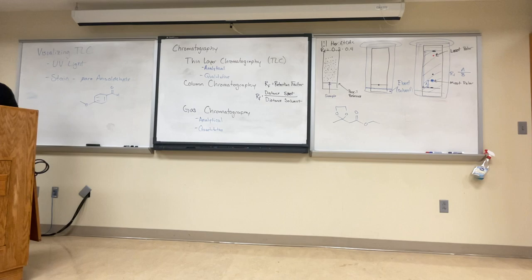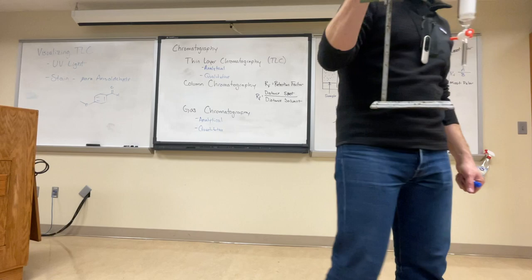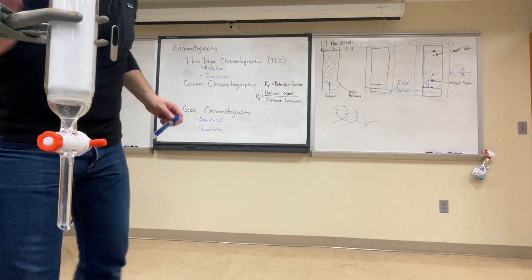So this week you're going to be doing column chromatography. We talked about column chromatography at the beginning of the semester. You're not going to be using these columns. These columns are expensive. We don't have a whole lot of them. You're going to be doing the same thing. Column chromatography functions the same way as thin layer chromatography, the one difference being that column chromatography is a preparative method.